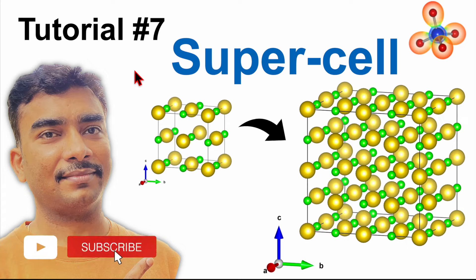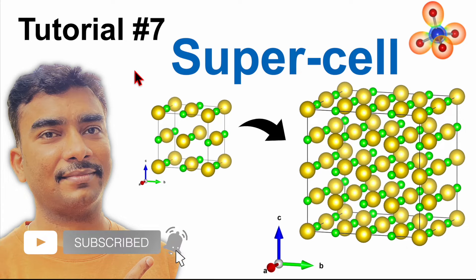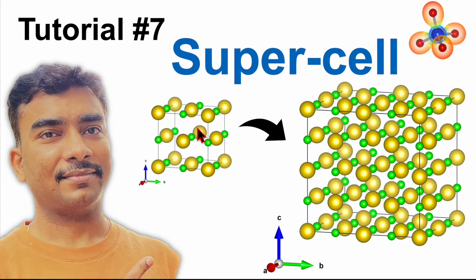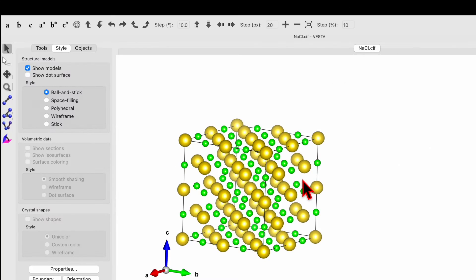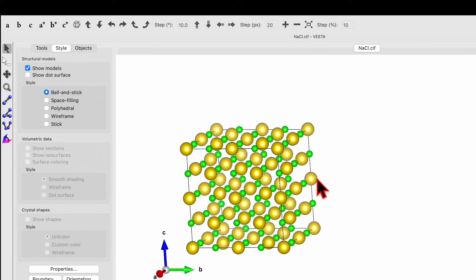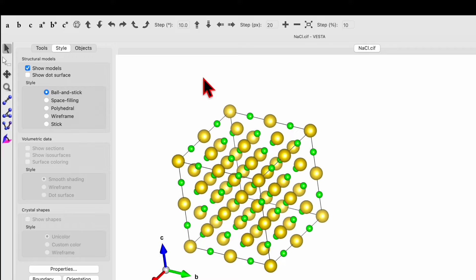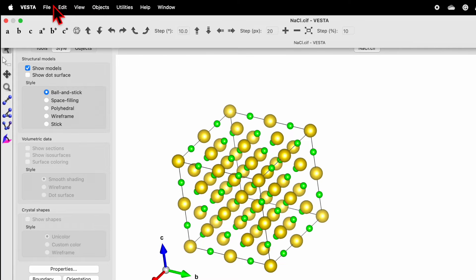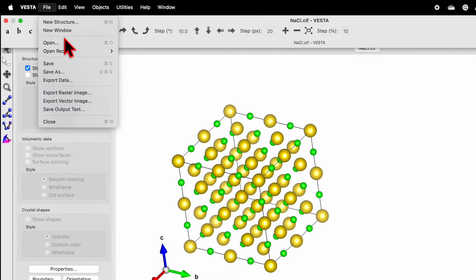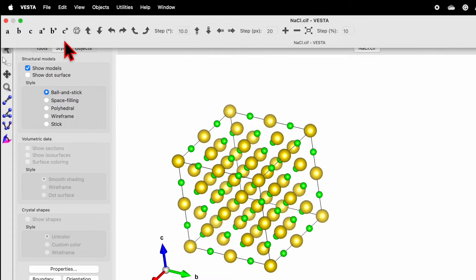Tutorial number seven on VESTA software. I will show you how to transform from a unit cell to a supercell. Here I have a supercell in the VESTA software. Go and click on file, open.